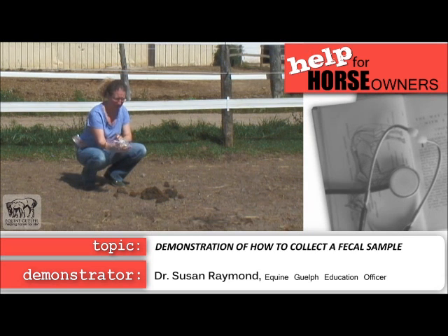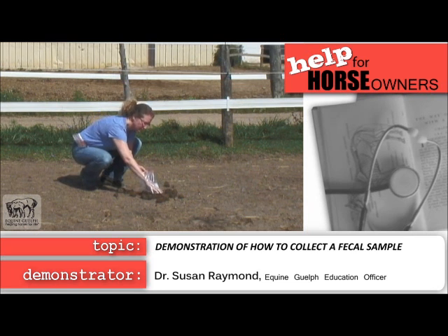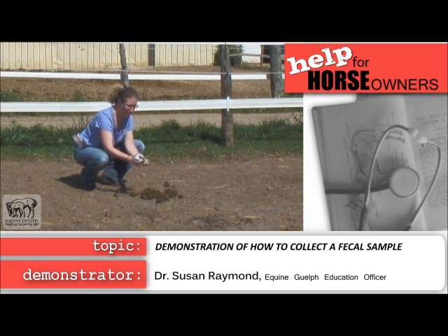You take a sample of manure — it's better to take it from the top section so it's not being contaminated from the ground below. Take a good size sample and pull the bag over your hand with your other hand.